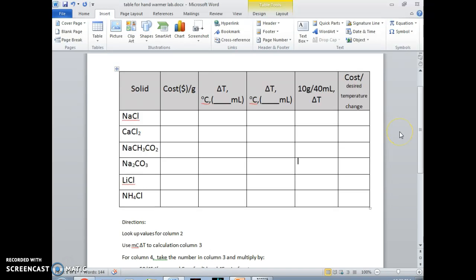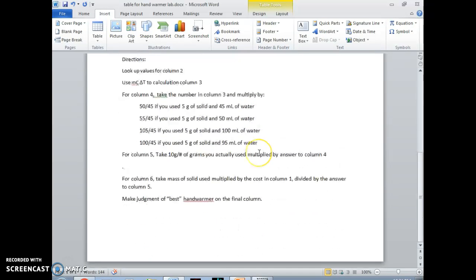So let's not write a full report this time. Let's just put down all that data, because that's going to be a lot of calculations. And some of these are going to be thrown out. The ones that made the temperature go down are obviously ones you can stop right here, probably, because we don't need this data, because we could care less about it. So you lucky winners just have to tell us that it went down, okay? Some of you are not the lucky winners. We'll try to make other people the lucky winners there.